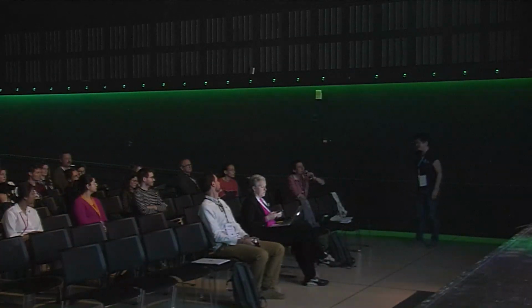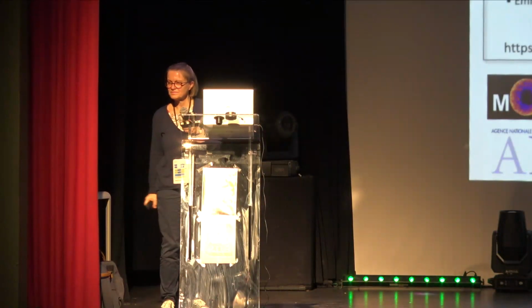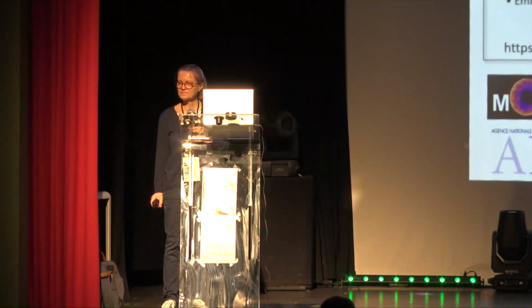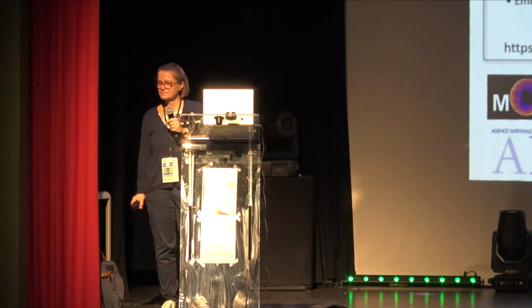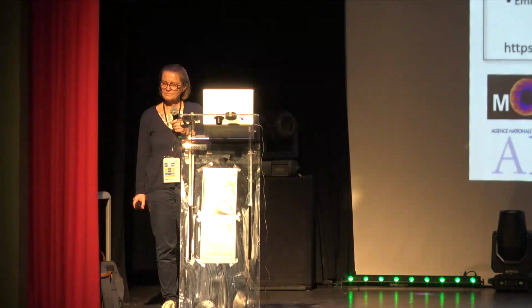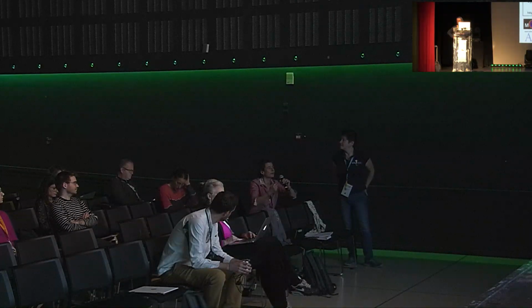Thank you very much, Marie-Claire, for this very instructive talk. Since we are at Module 5, but in parallel to Module 6, there are common questions that we have. I was wondering whether you can stress a little bit on how the variation of the SHG signal can inform us about the mechanical properties in time of the tissues related to the Young modulus, for example, and whether it is possible to extract more quantitative information from that.